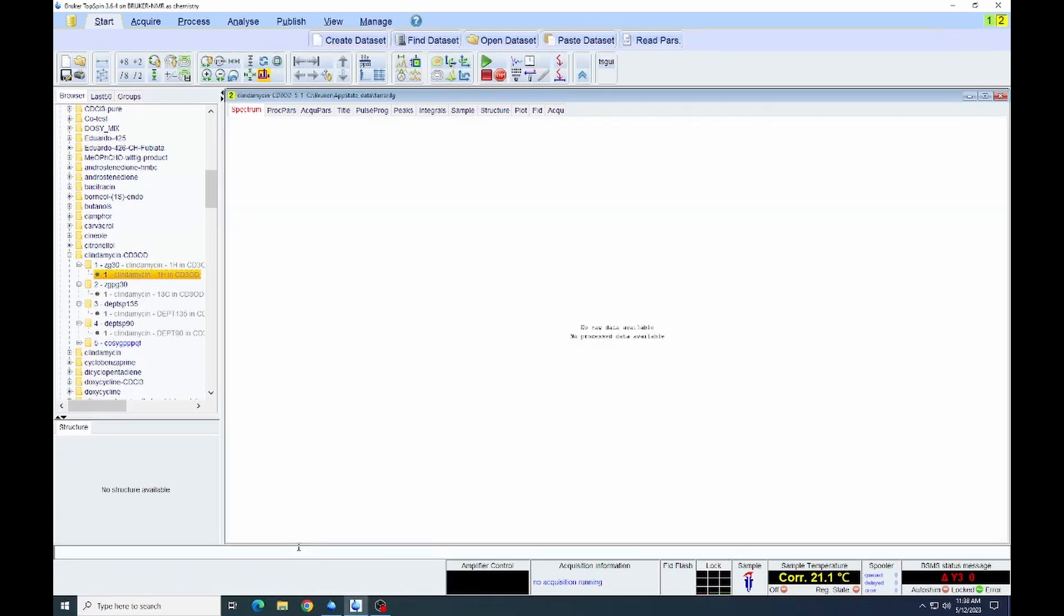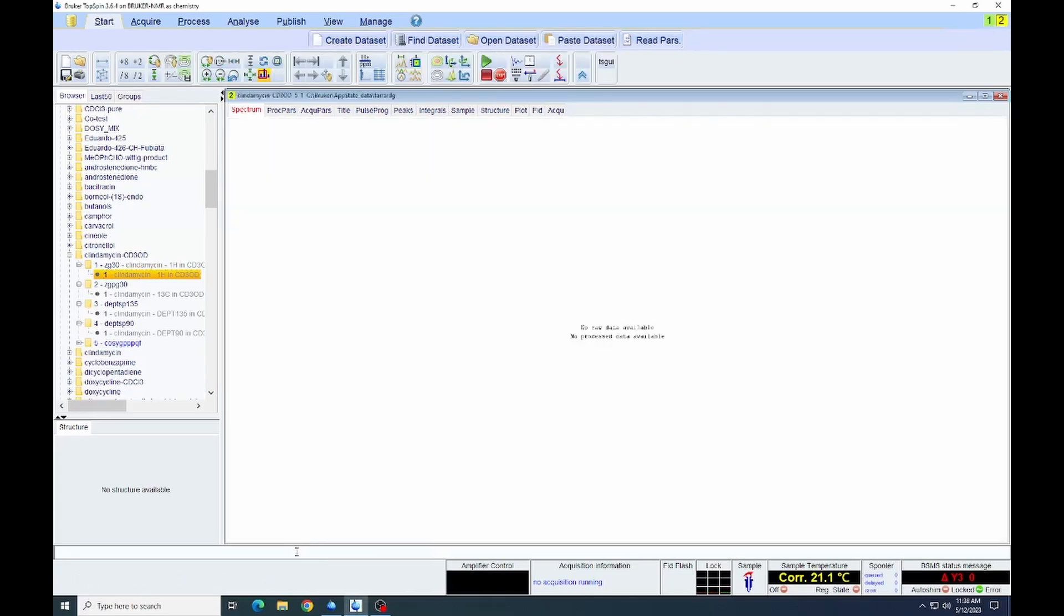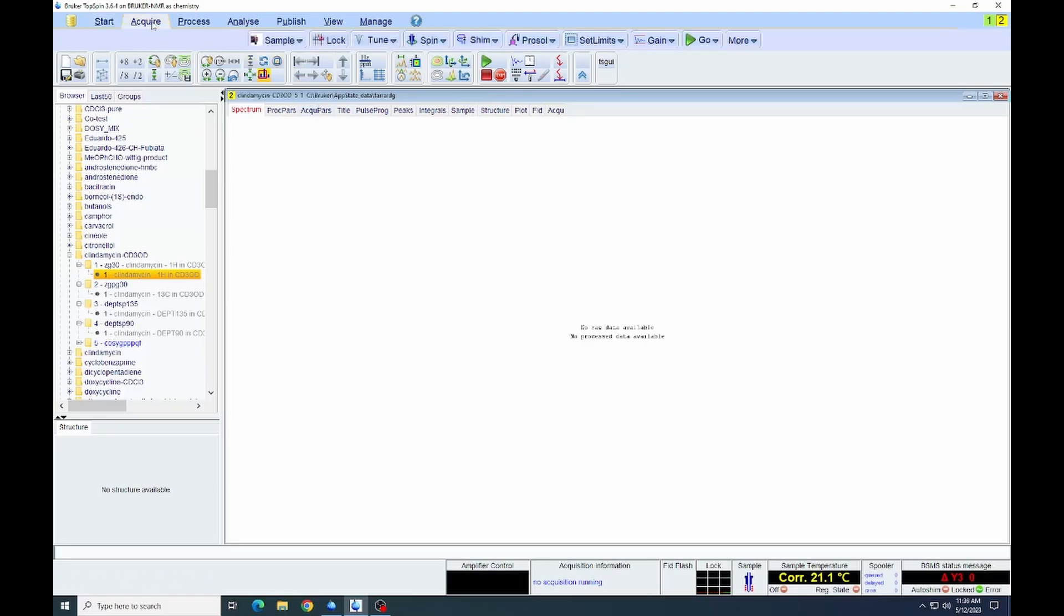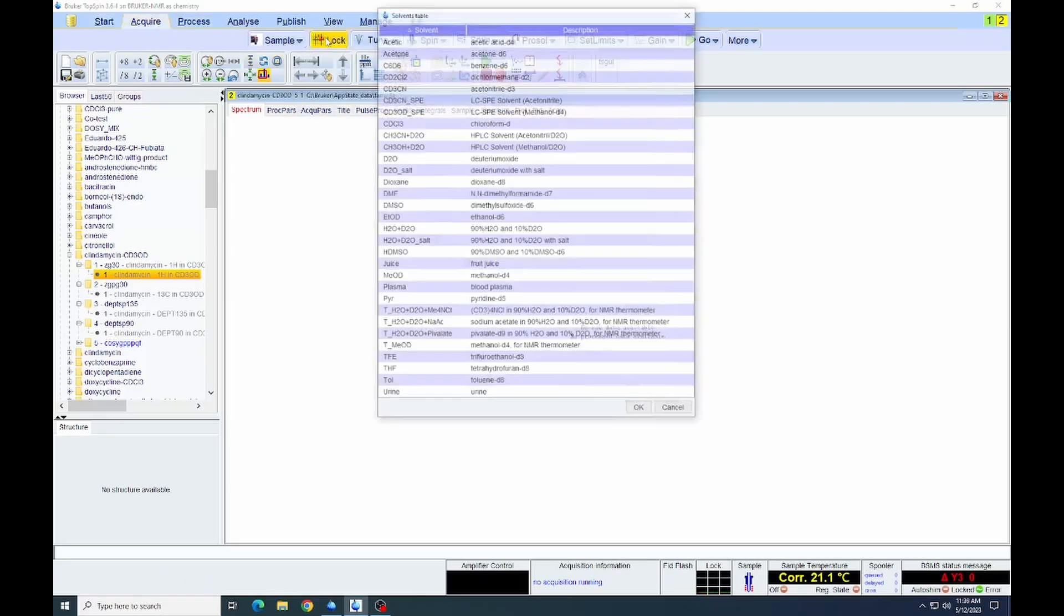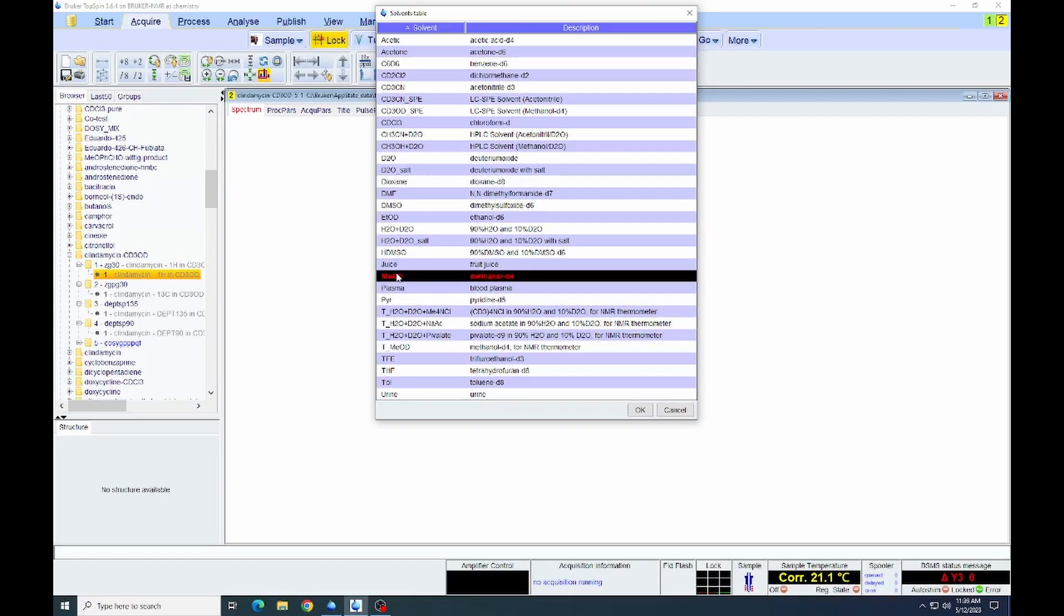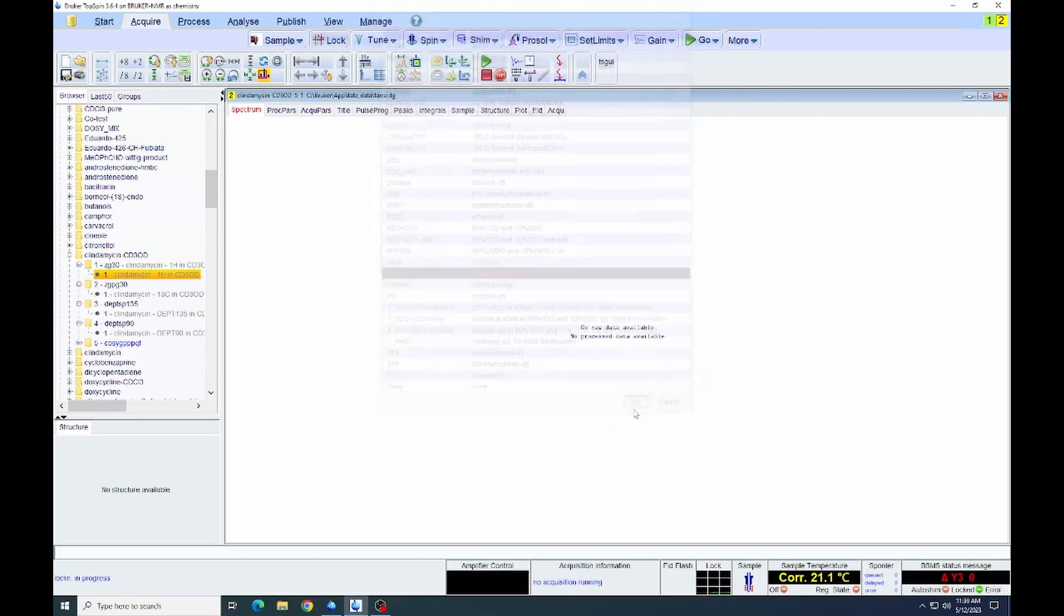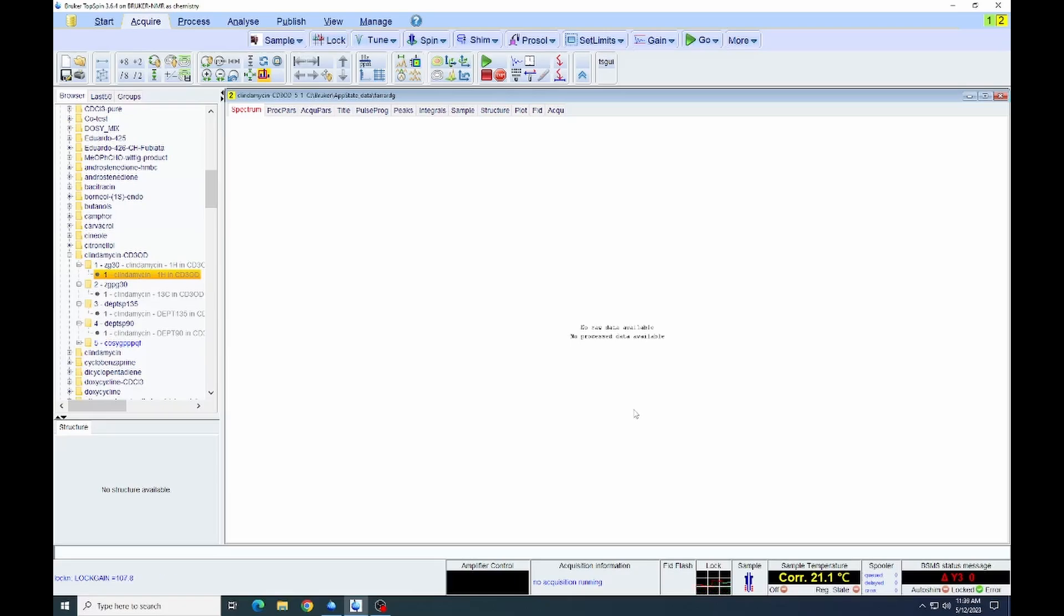If you've not already done so, you can go to the acquire button and lock, tune and shim the sample. I will be briefly going through that here. We're not going to watch the entirety of the locking process or shimming. But if you haven't removed the sample after acquiring the proton, of course, you will have locked and tuned and shimmed on that one. It's not necessary to redo those. But if you have removed the sample and then reinserted it, you will have to redo the lock, tune and shim.